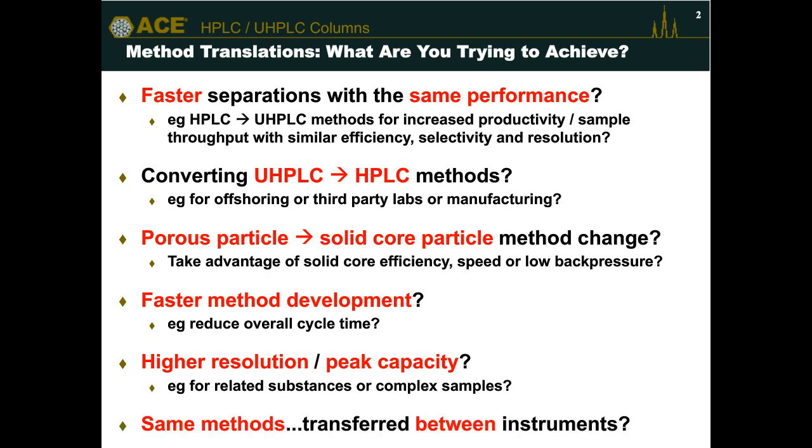Finally, not every instrument in our lab is from the same vendor. So we might want to run the method on different vendors' instrumentation. And it's the same method, but it might work slightly differently on each instrument. So we need to know what things to consider when we're translating our methods from one instrument to another instrument.